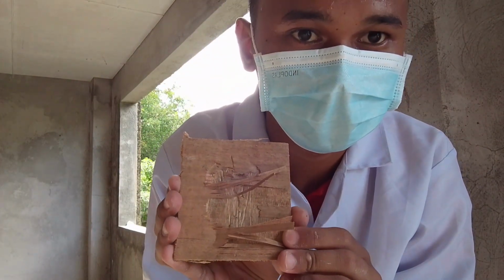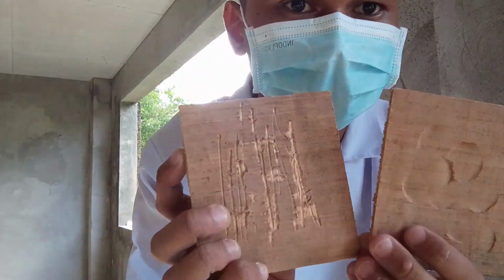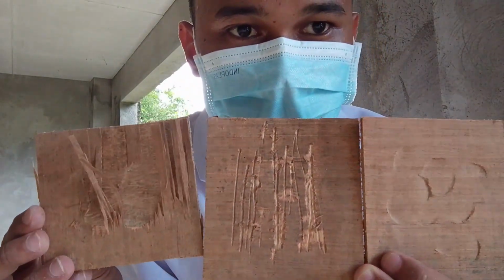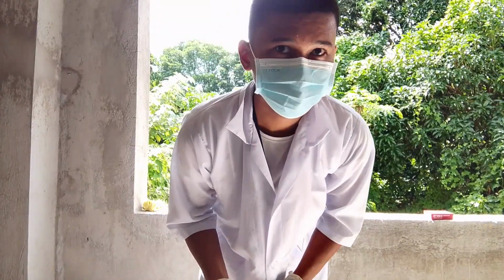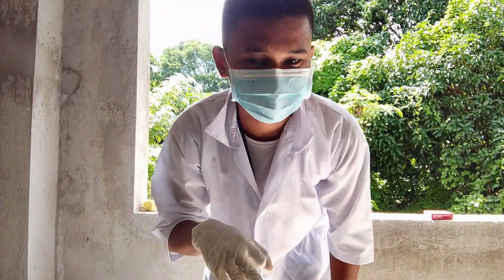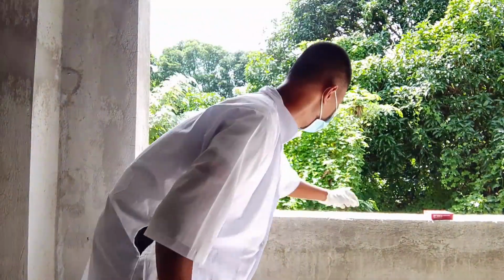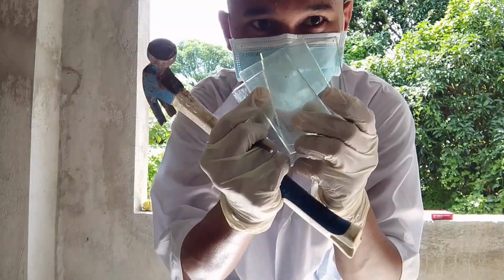So I am done. I am done doing the different types of tool marks, which are the negative impression, abrasion or friction mark, and the combination mark. I will now proceed to analyzing and identifying patterns of glass structure such as radial, concentric, and convoluted. For this procedure, I will use a hammer, a nail, and 3 glass.